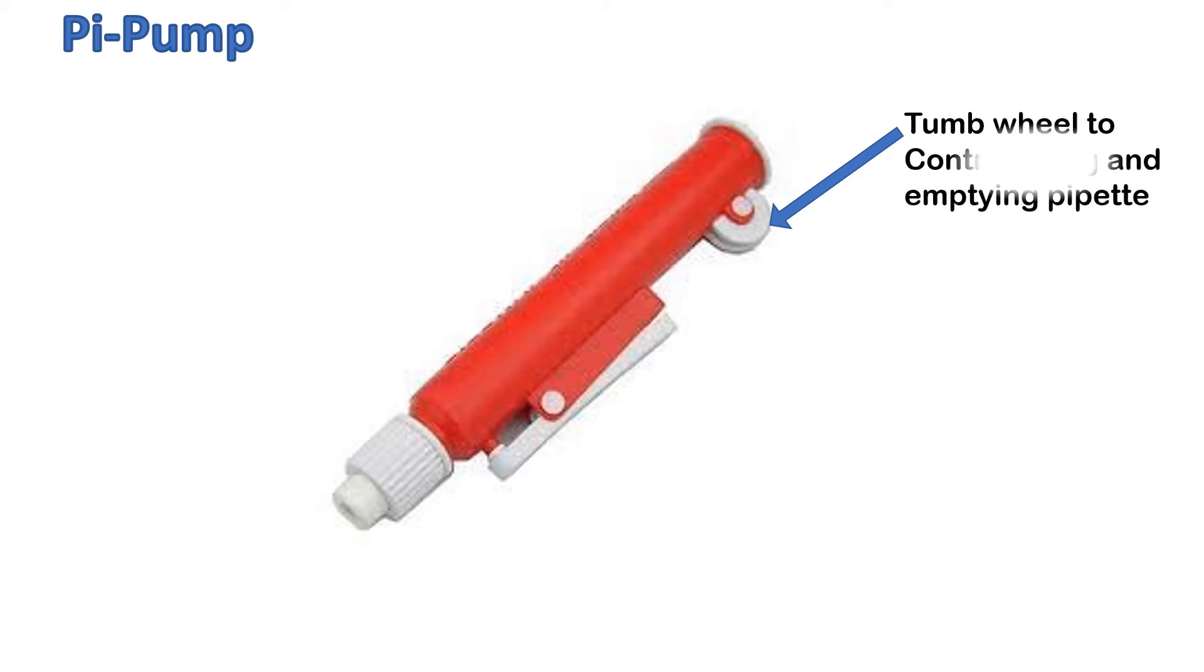There are two parts in a pipette filler: thumb wheel and lever. The thumb wheel is used to control the pipette filler when filling and emptying the pipette. The lever is used to dispense liquid rapidly from the pipette.